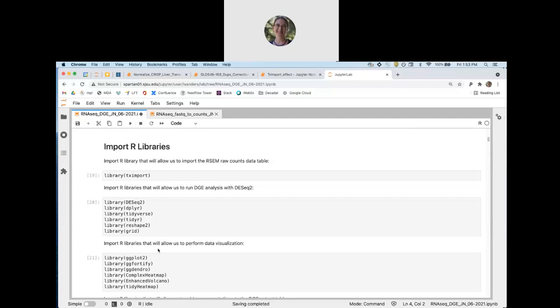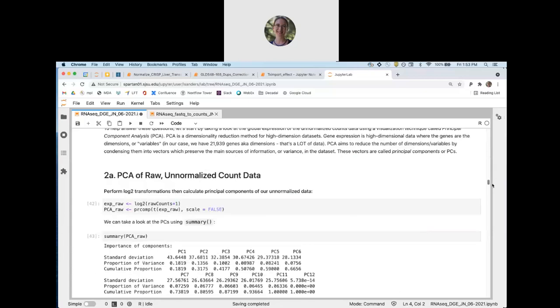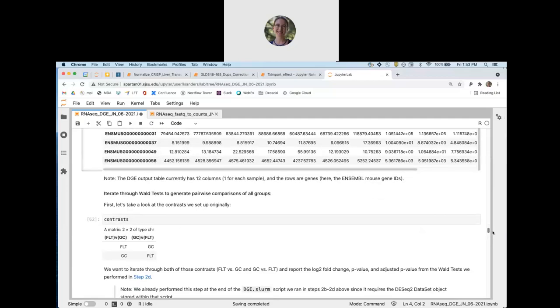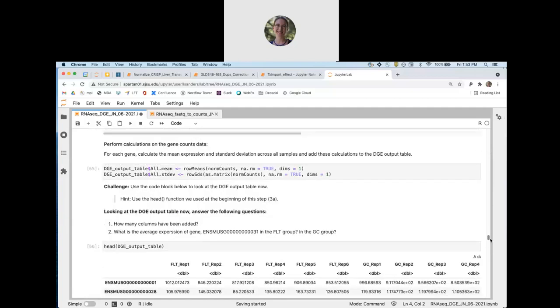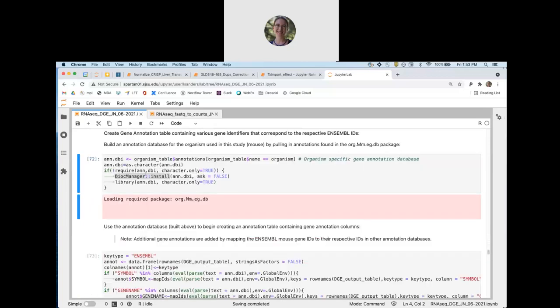But Stephen installed everything back at the beginning of this year, which means that there was plenty of time for a database to change. So in this case, we just installed it. And now we're searching a locally held database. So we're not searching the web, we're searching a database that we just installed.